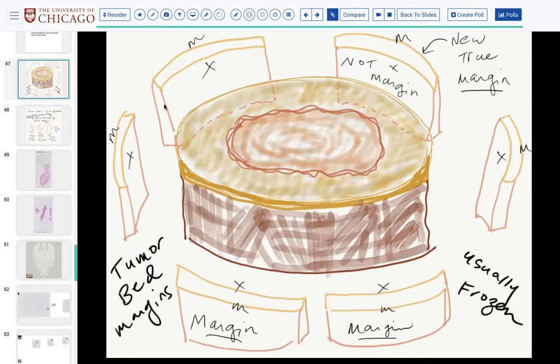Mostly, these pieces have a thickness, right? But they are not always oriented in terms of which side is closer to the specimen that they just sent and which side is actually still in contact with the patient. So each strip has a non-margin side and a true margin side, but most surgeons don't orient them, though sometimes Dr. Blair orients these.